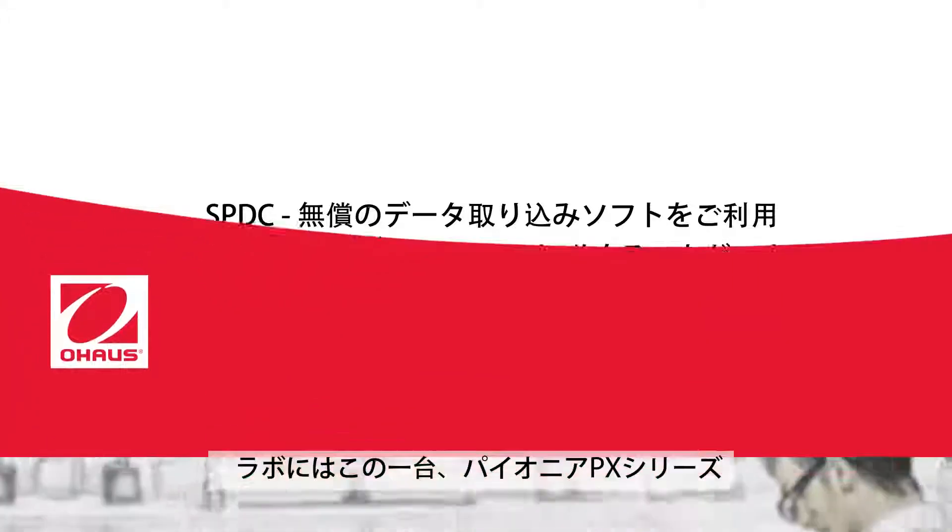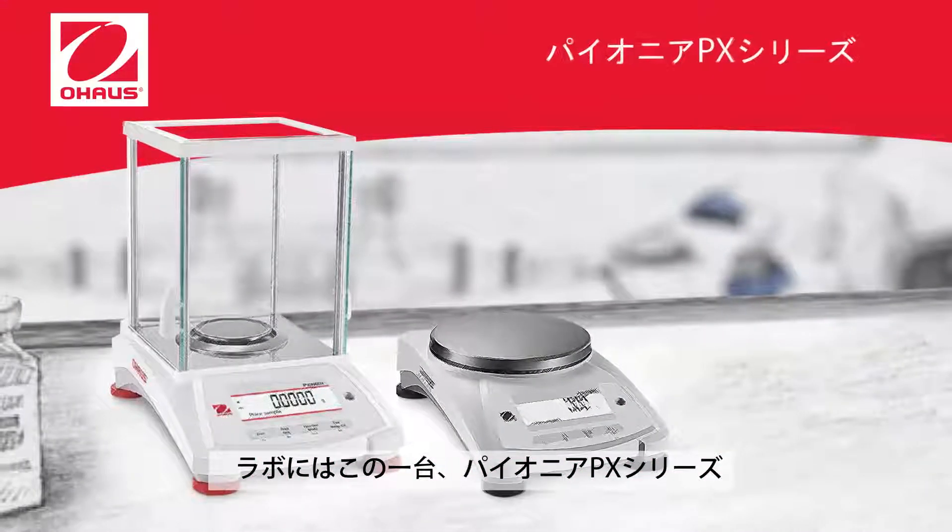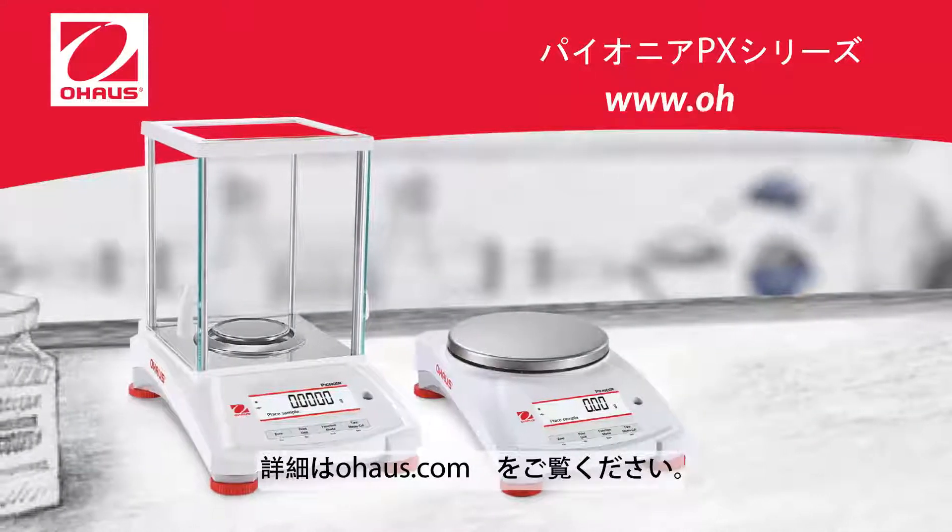The Pioneer PX series belongs in your lab. To learn more, visit us at OHAUS.com.